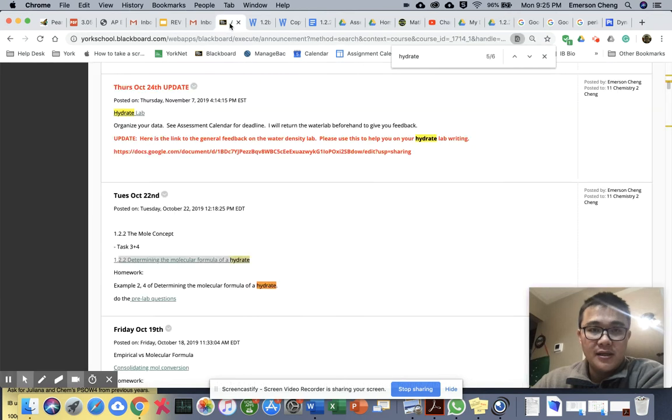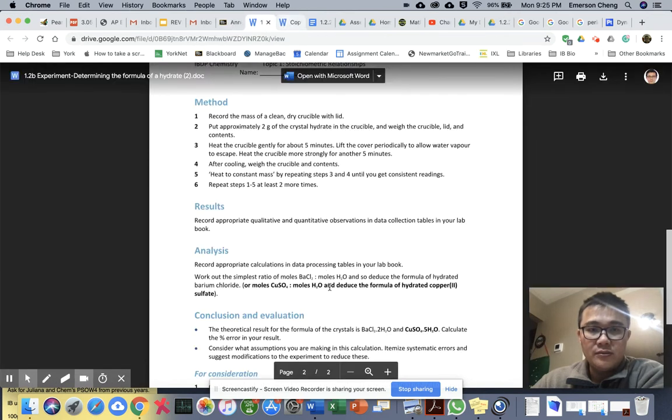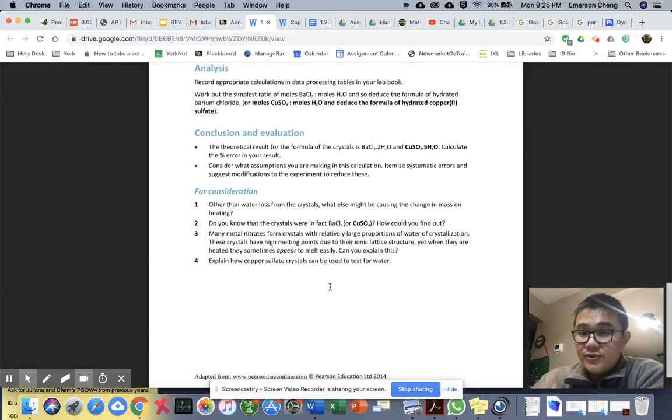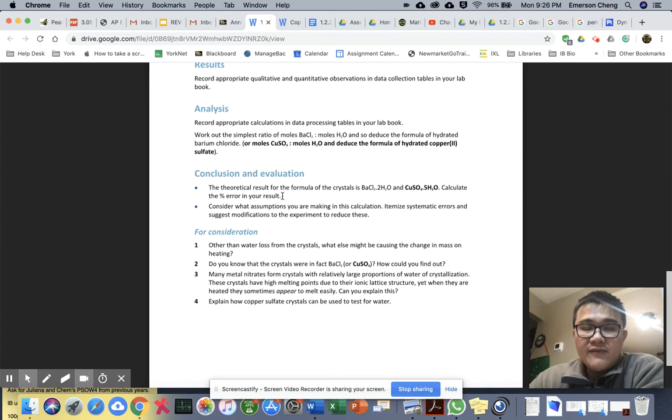Now, in terms of the evaluation, you have to figure out: was the hydrate heated to a constant mass? That's one thing.